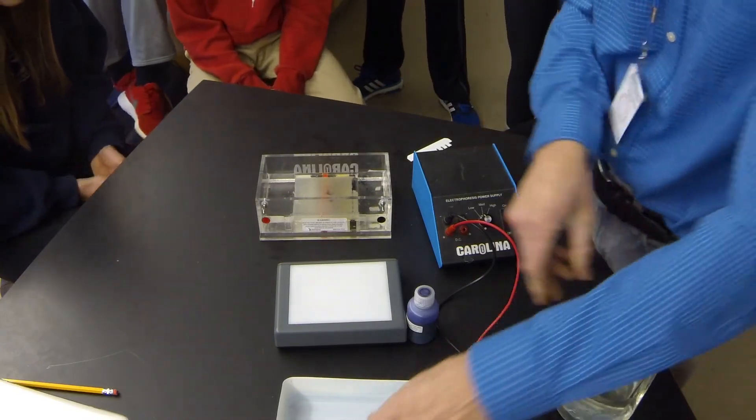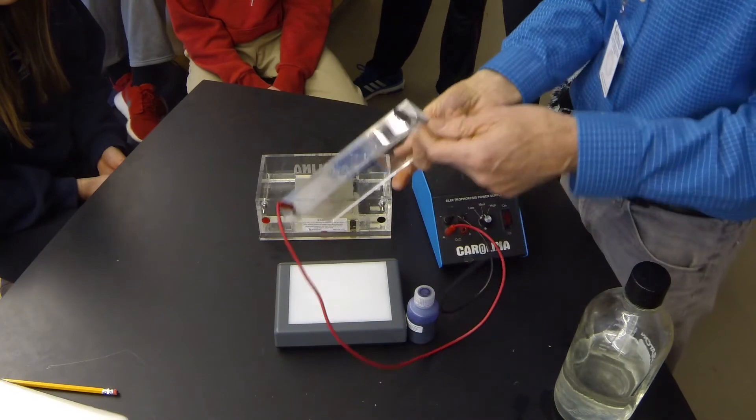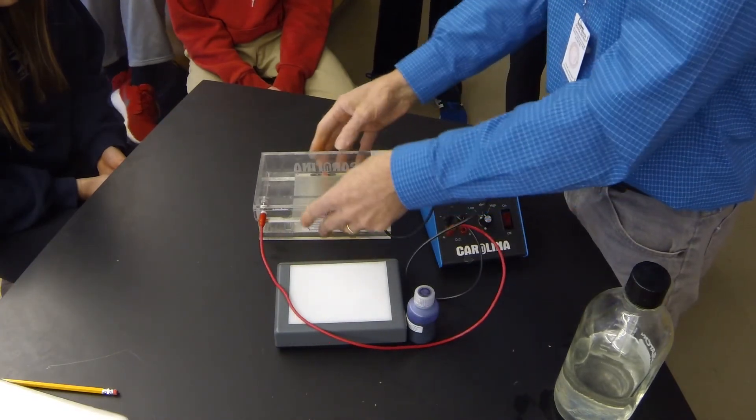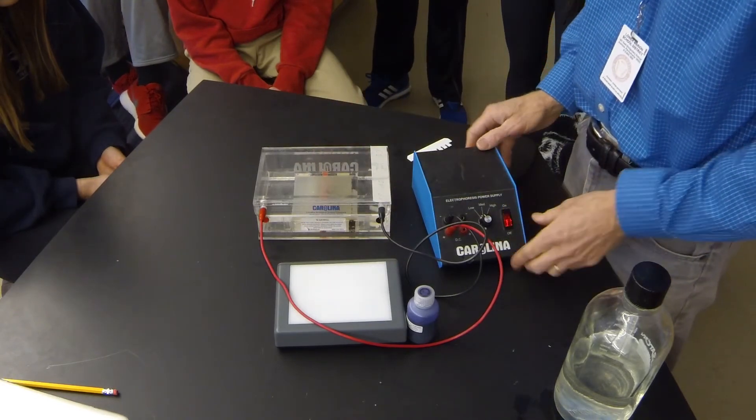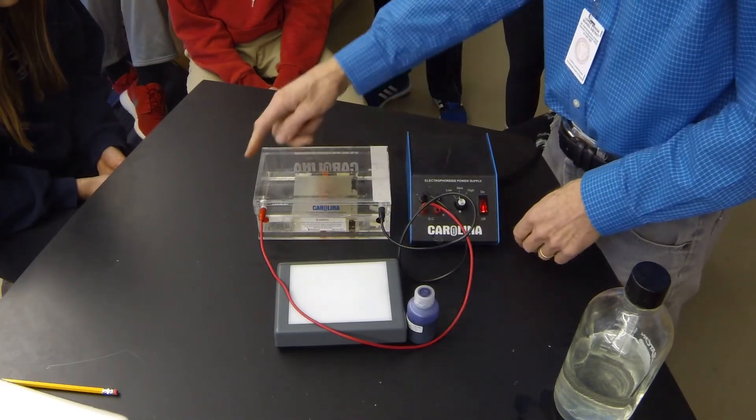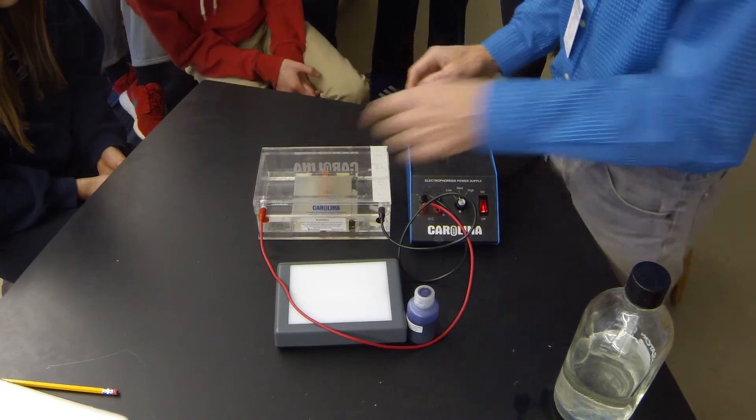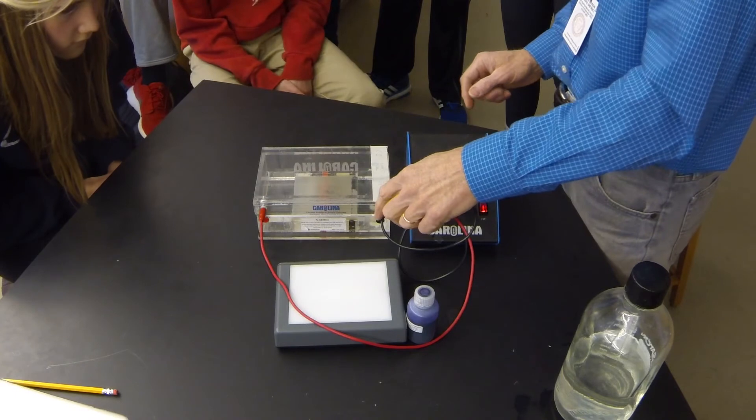And the way it works is this lid has electrical probes hooked to it. When I hooked it like this and turn this thing on, electricity is now flowing through the gel and through the solution. Now this end is a positive end and this end is a negative end.